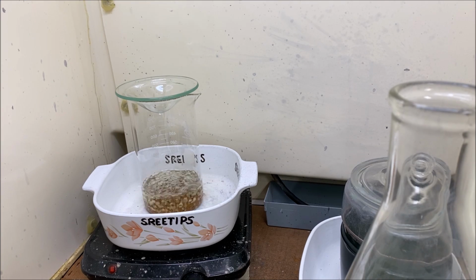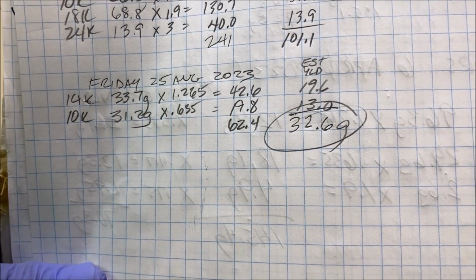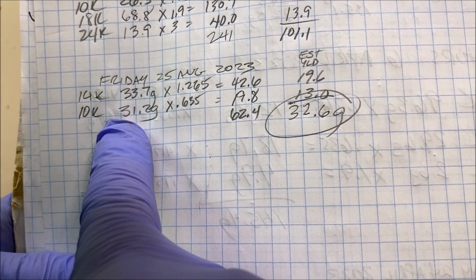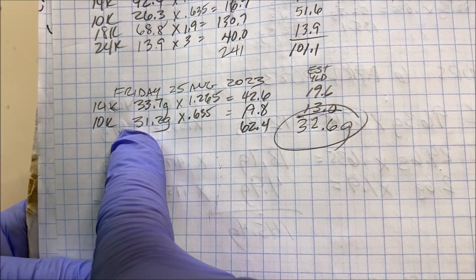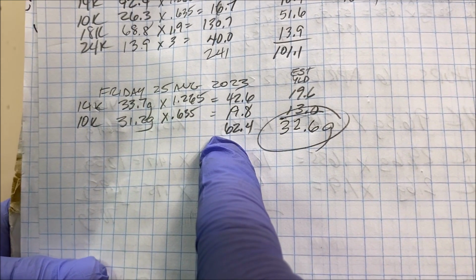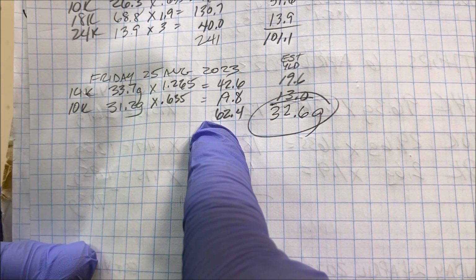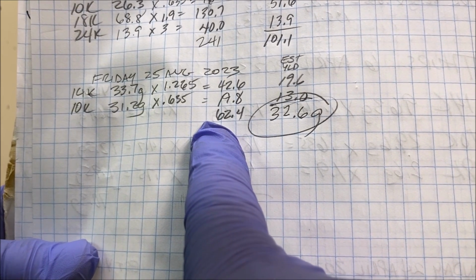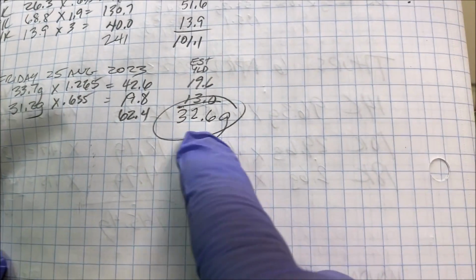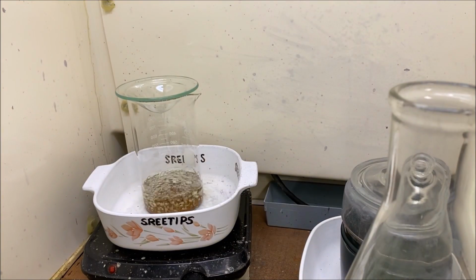I've had this boiling now for about 20 minutes, just to give you an idea what we're doing here. This is the specs on this batch. I had 33.7 grams of 14K, 31.2 grams of 10K, and I quartered it with silver, parted with nitric, and then we dissolved it in aqua regia and precipitated with SMB. That's what we have in our beaker back there, and we're expecting 32.6 grams of pure gold from this batch.